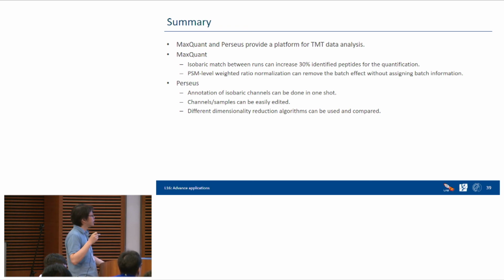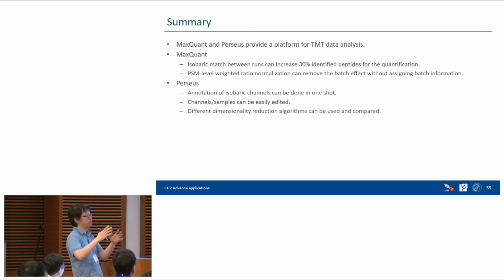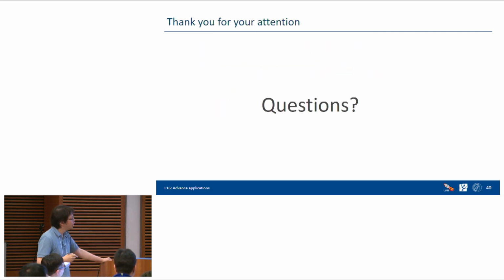Just to let you know, running UMAP and t-SNE is different from running PCA. In PCA, it will directly plot the PCA plot for you. But for t-SNE and UMAP, because they originate from R, we are still not able to transfer the plots to show in Perseus. So all we did is give you another matrix which contains all the information.